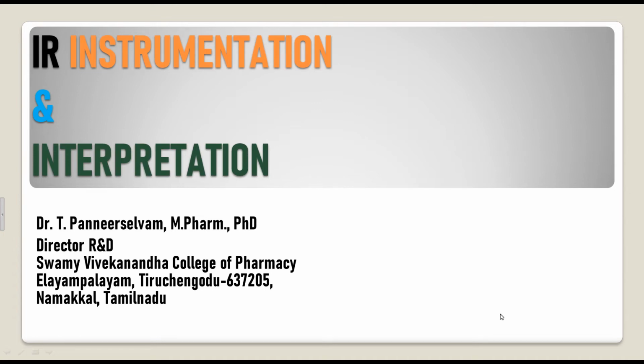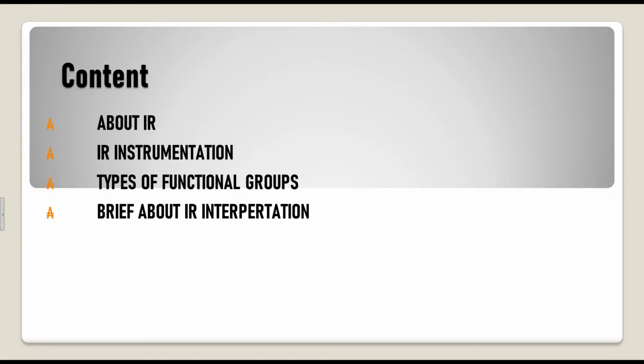In this video, we are going to see about IR instrumentation and interpretation. Under this heading, we are going to cover the following content: IR and IR instrumentation, types of functional groups, and finally, a brief about IR interpretation.